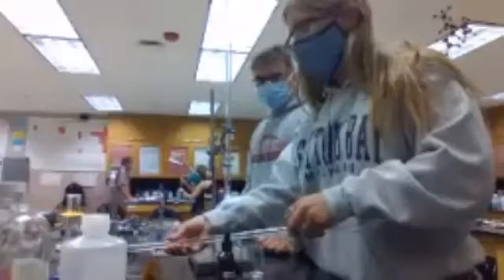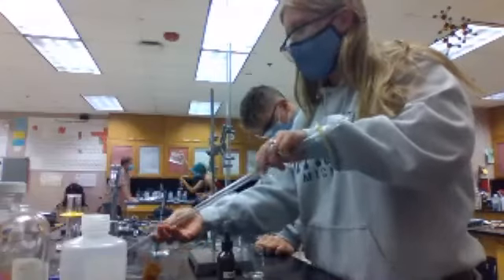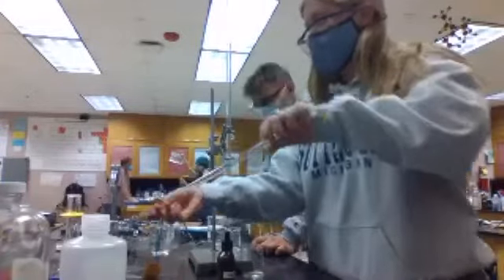We need a graph for this one too. We're probably not going to be able to get the graph, because that's when you have to take the pH of everyone. So we're going to do the graph tomorrow, because you only need to do one graph of each. Since this is the first trial, I'm going to see how this goes.